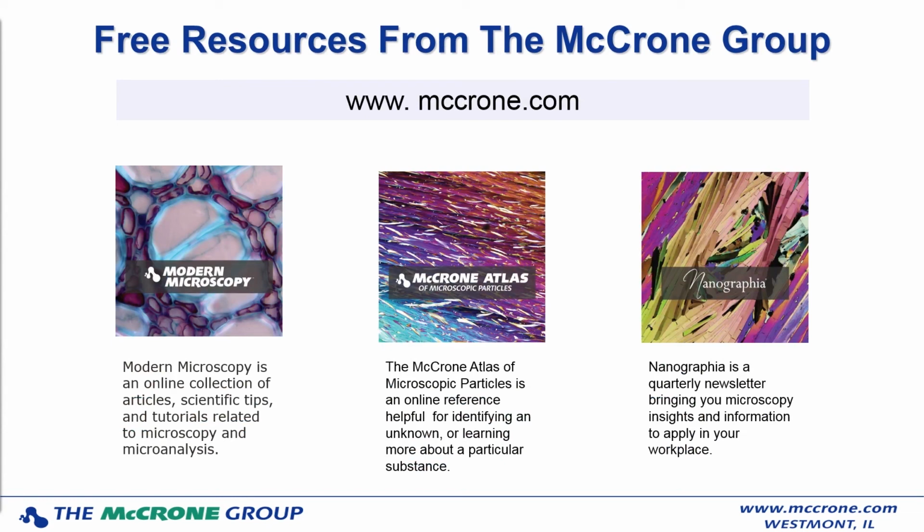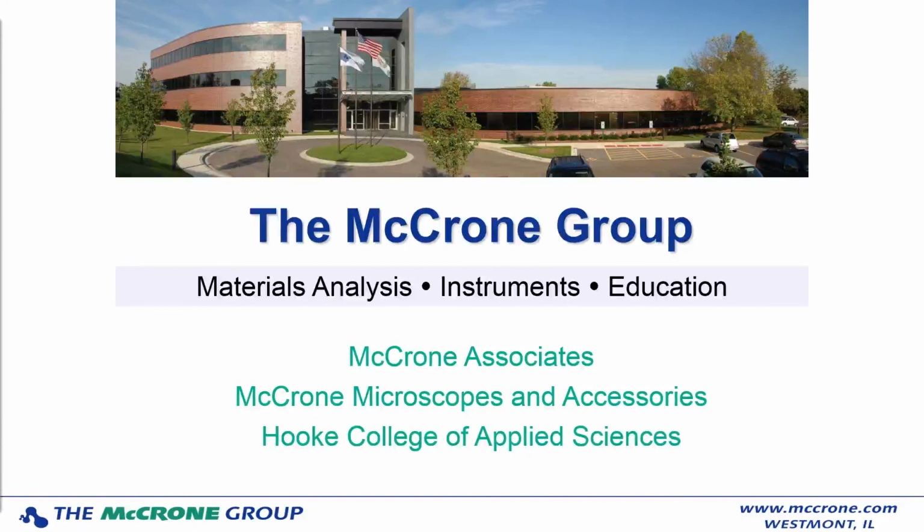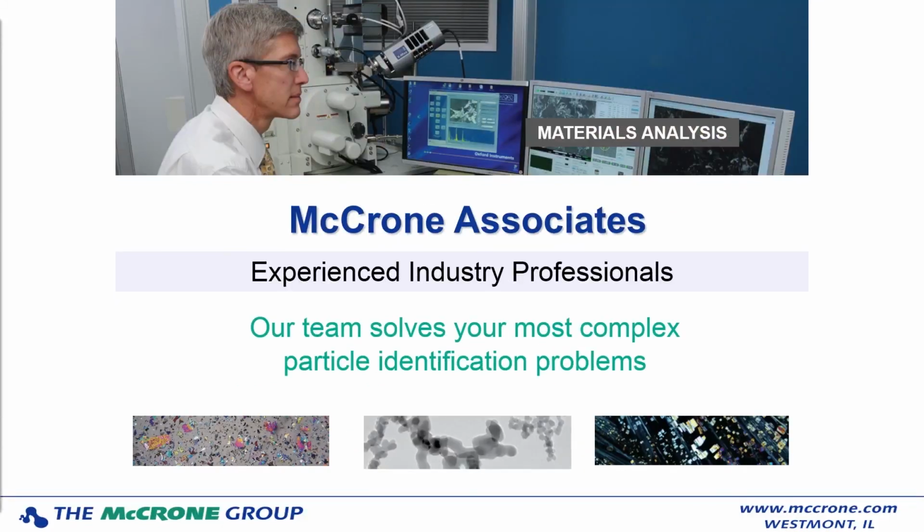Actually, I have not, but that would be interesting to see how crystalline paper is, and that's something we could probably do on a small scale. We would probably do a sample size of maybe square, a couple hundred microns would be suitable for us. But no, we have never measured that, but I don't see why we couldn't do that. The only issue might be if the paper is very thick, we wouldn't be able to do it by transmission because we'd get a lot of absorption from the paper.